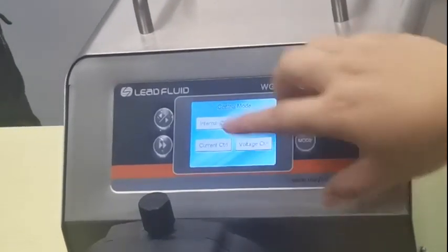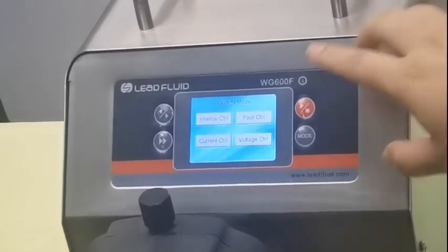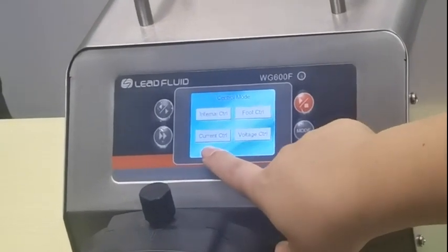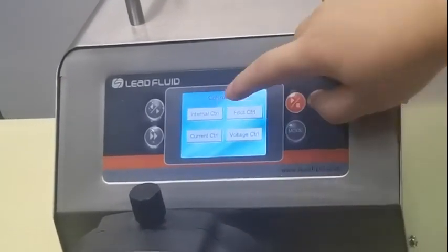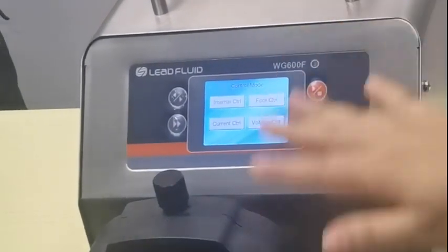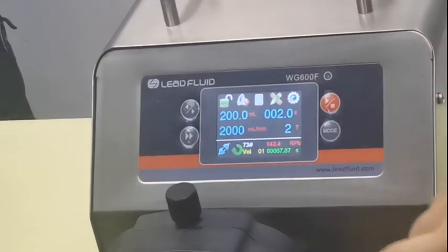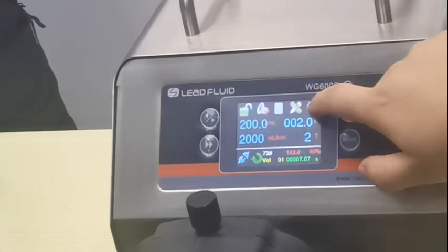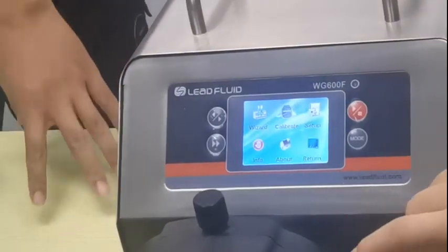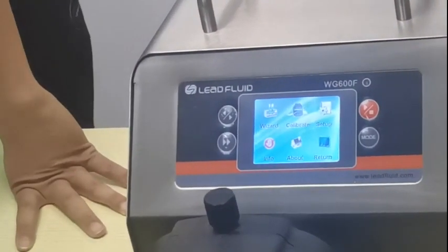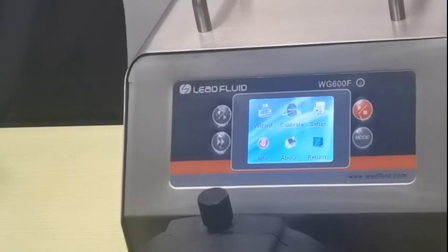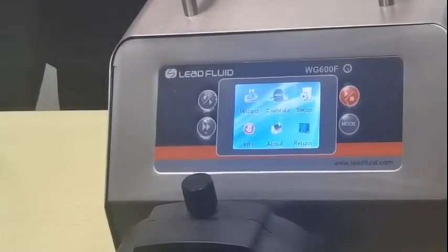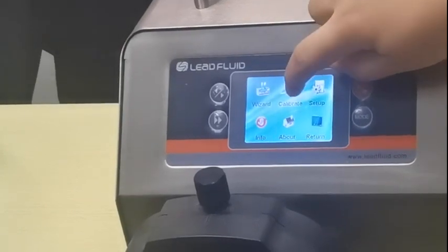Control can also be done via external signal — many customers use the international standard for current and voltage control. And when you need to transport different liquids, it is better to calibrate the pump first.